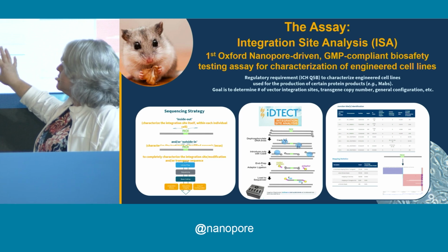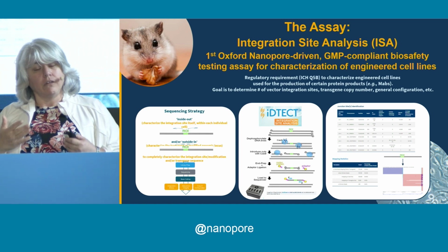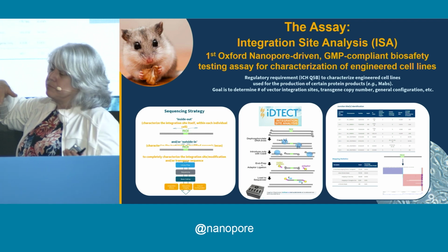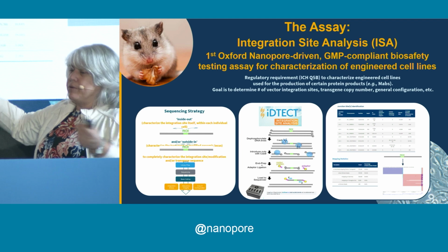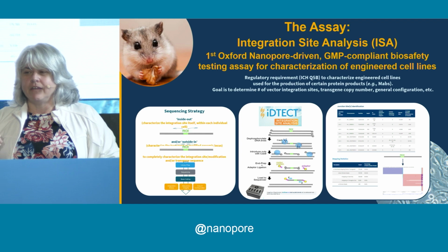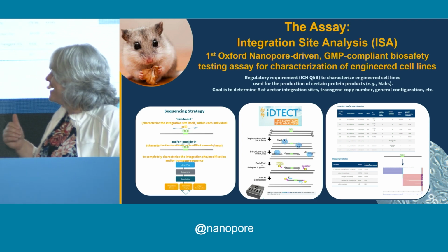Whereas you can do it in a single nanopore-based sequencing test, and the key is, of course, you need long reads to do this. So effectively, it's a 2-round test where you use a CRISPR-Cas mediated mechanism, which you've already heard this morning. You target the region of interest, and you sequence out, and you figure out where it is in the genome. And every other genome other than a hamster, that's easy to do. Someone threw a hamster in the mix.